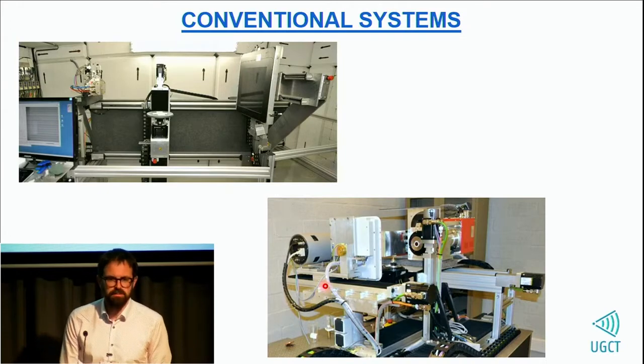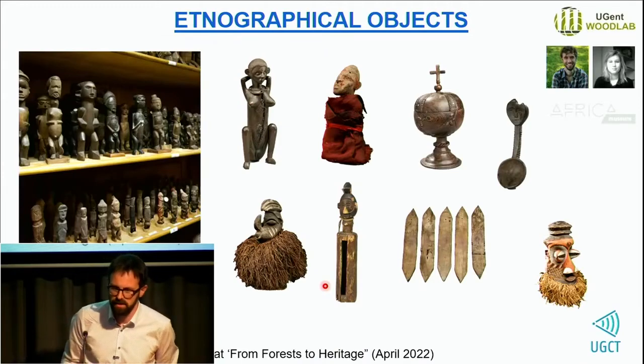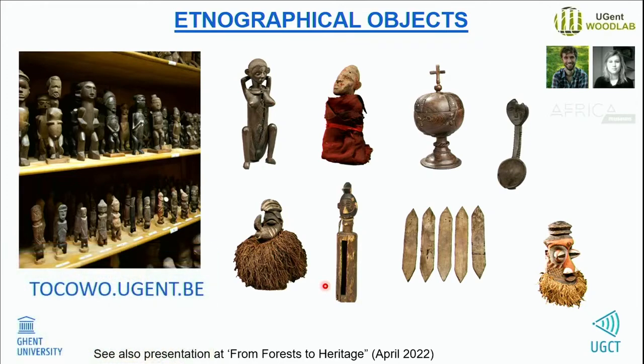So that's for the structural imaging, but also the analysis. Unfortunately, the time that you could do a CT scan of something and say, oh, I have a pretty picture, meaning I have a publication about this, those days are long gone. So you need to have a lot more of this analysis, and you need to say a lot about what you've actually done. The first application I'm going to show is a little bit following the previous presentation. So also cultural heritage, but the African cultural heritage from the Africa Museum in Brussels.